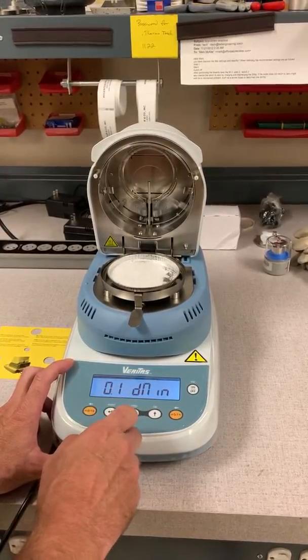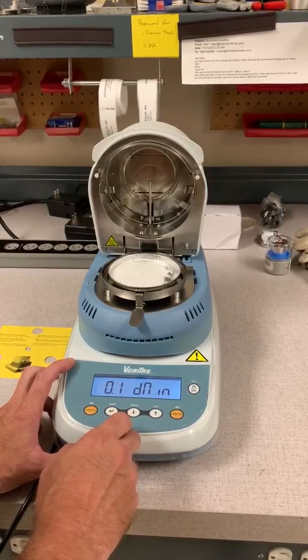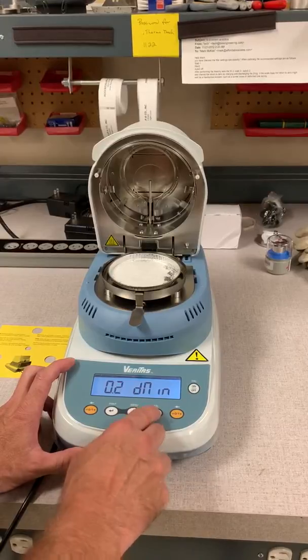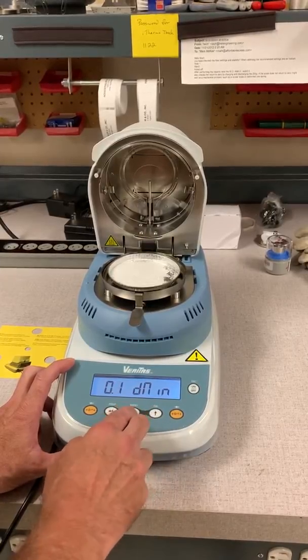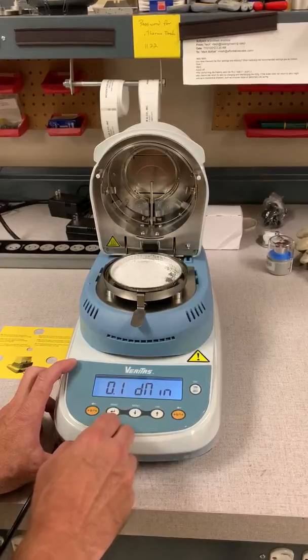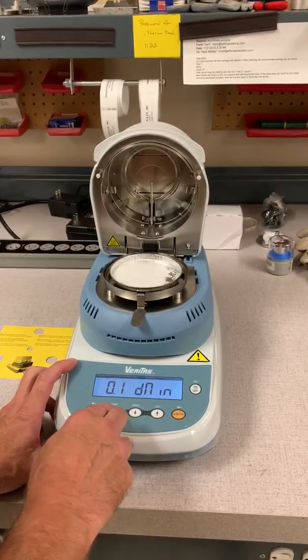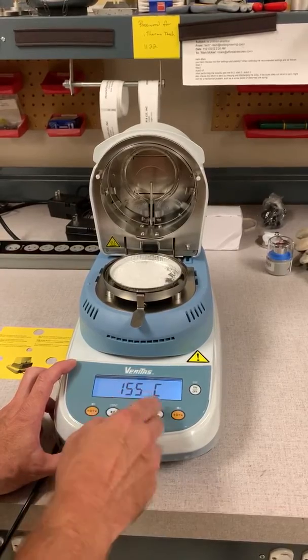We're hitting a rate of 0.01% per minute. It will automatically shut off. If you want to change that, use the up or down arrows to change. Once you have what you want selected, press print to accept. Temperature works the same way — once you have your set point, press print to accept.